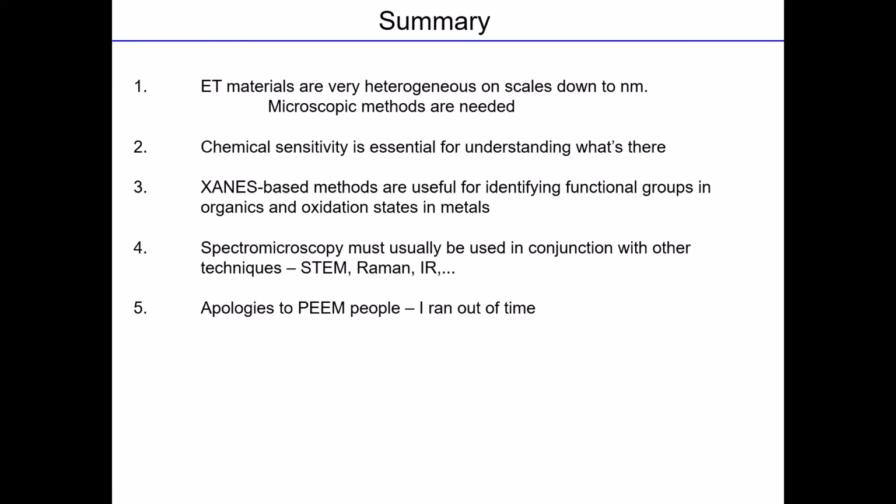The people who have these materials, what's the one thing they wish they could do that presently we can't give them at the synchrotrons? That's a good question. I don't really know. I think mostly just being able to do more of it, because these materials being so diverse, you really have to study a lot of different samples and a lot of different regions on a sample. So I think you really want to be able to study many particles many times.